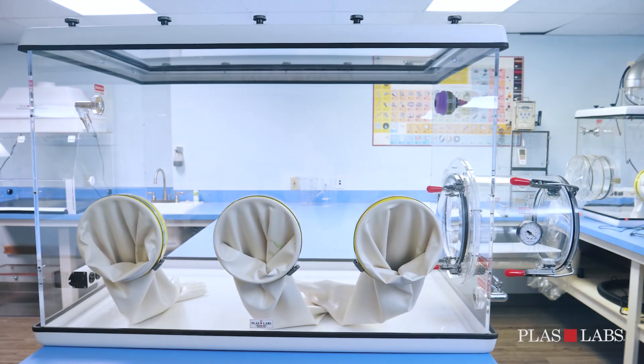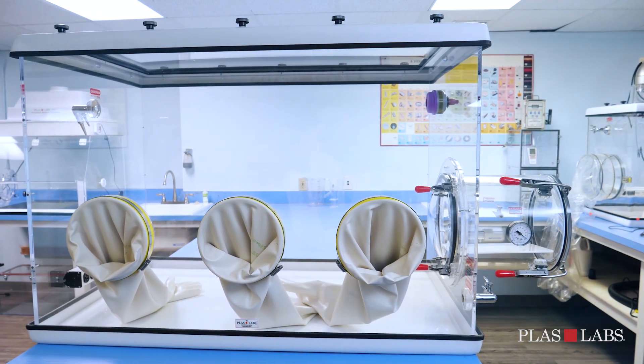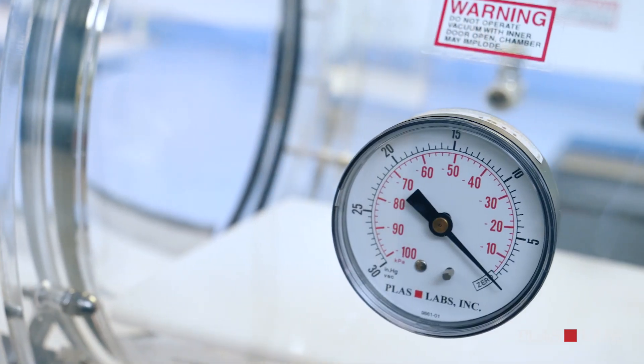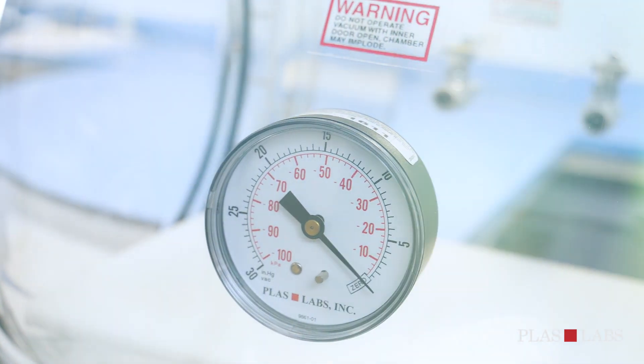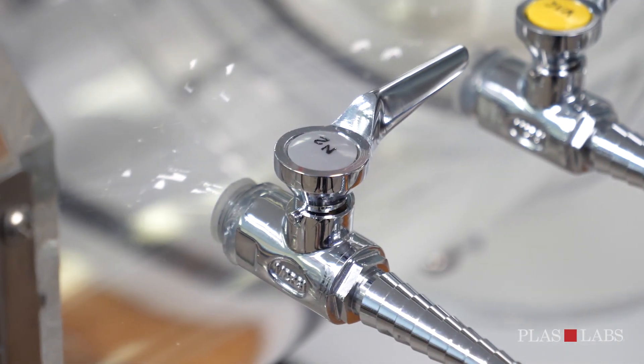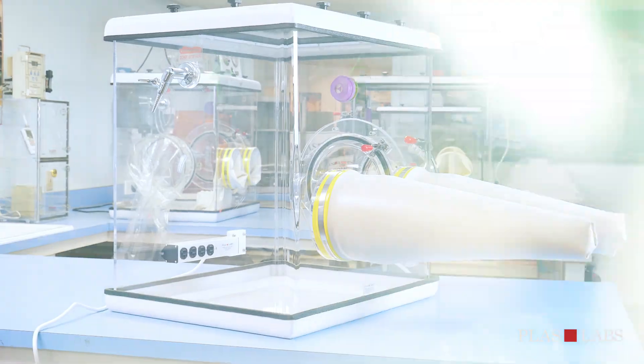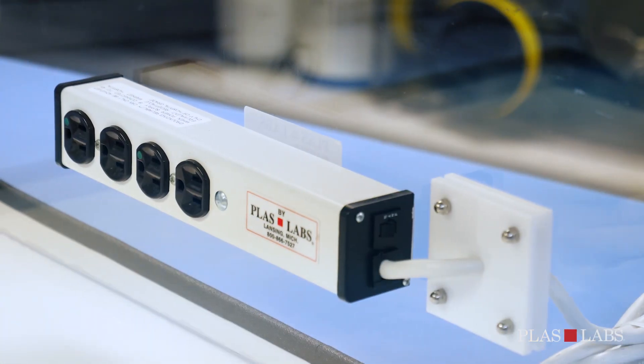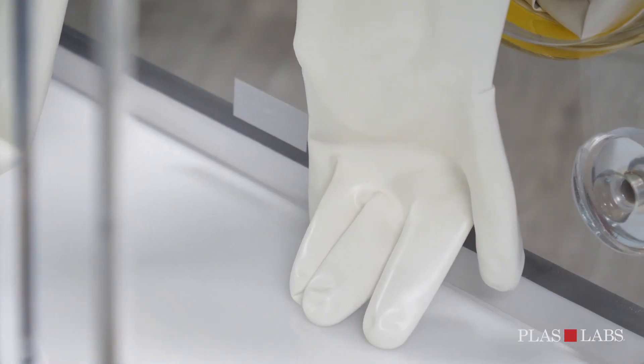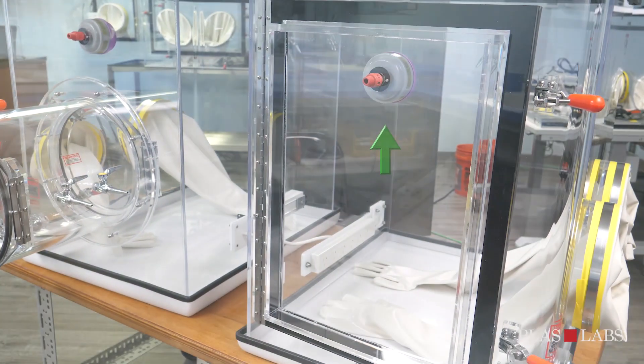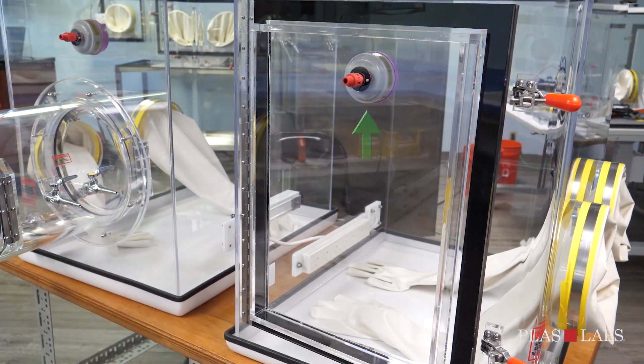Each 830 series glove box comes standard with transfer chamber with purging valves, pressure gauge, and leveling tray, two purging valves on the main chamber, removable top, electrical outlet strip, white ambidextrous hypalon material gloves, and small pressure relief pop valve with a small HEPA filter.